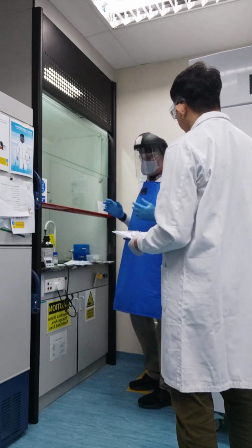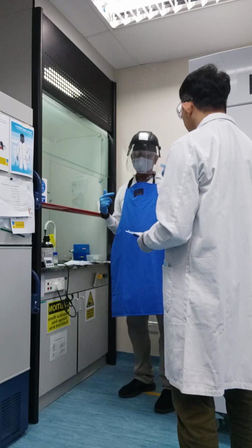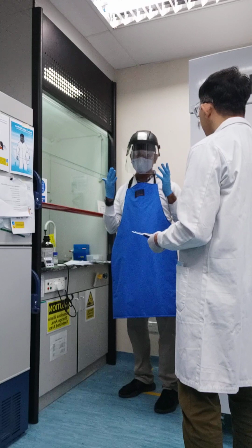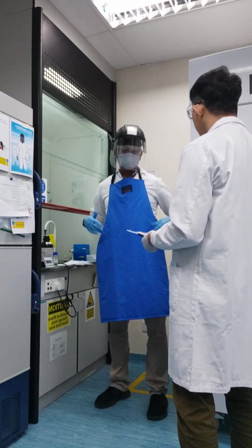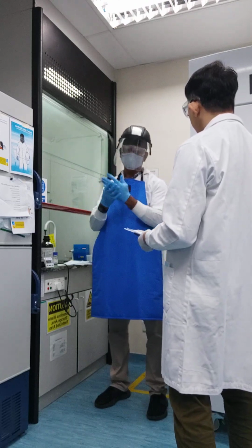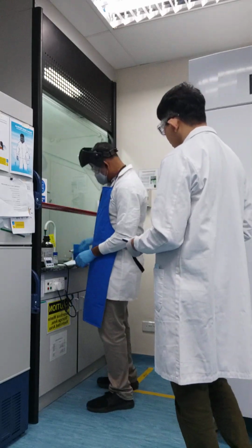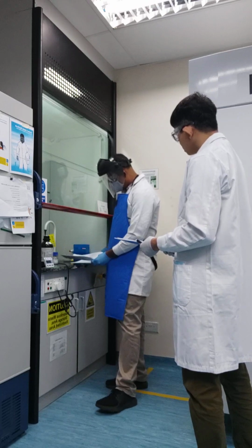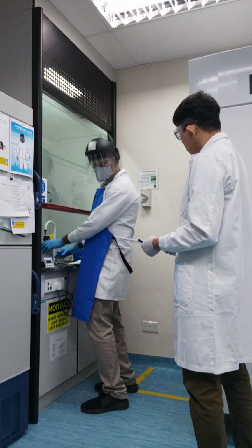And then make sure you have conducted a full body check of all the personal protective equipment. So you have covered your face and eyes with the face shield. And then after that you've got to protect your torso with an apron, and then you have the chemical gloves. So before we start conducting the experiment, make sure you follow all the instructions according to the MSDS, and then you can start conducting the experiments.